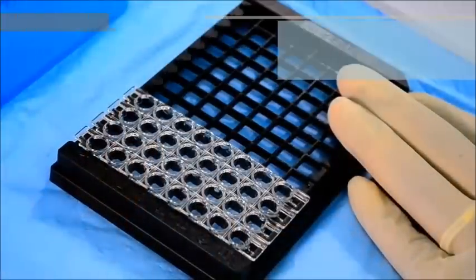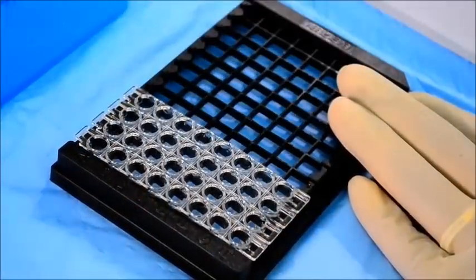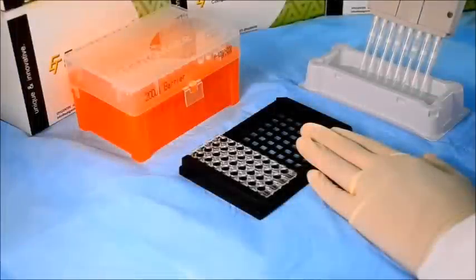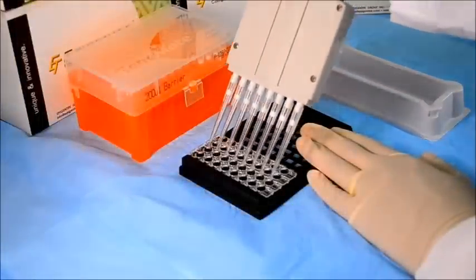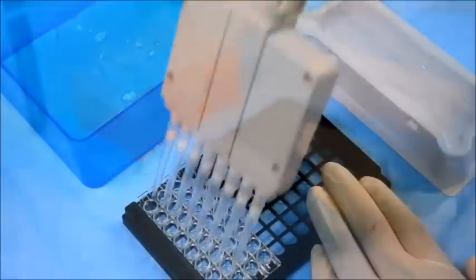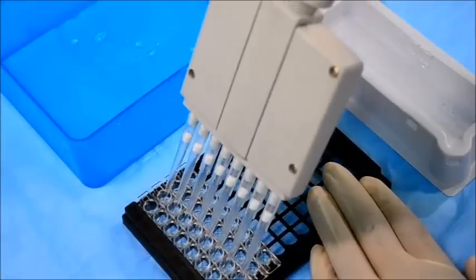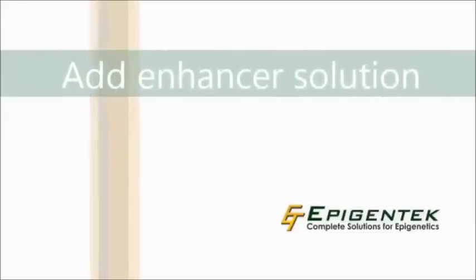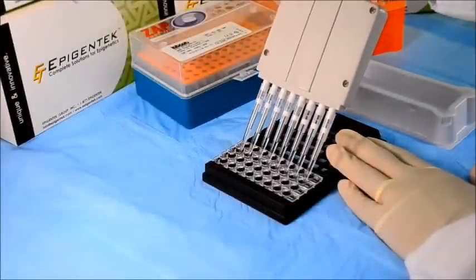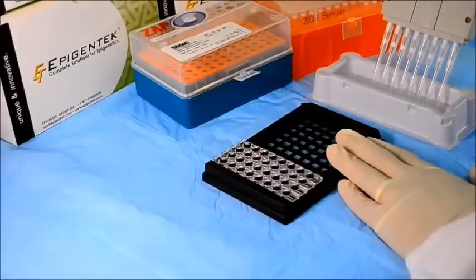Then wash the wells. Next, add the detection antibody to the wells and incubate at room temperature, followed by washing the wells. Now add the enhancer solution to the wells, which will intensify the color development signal.